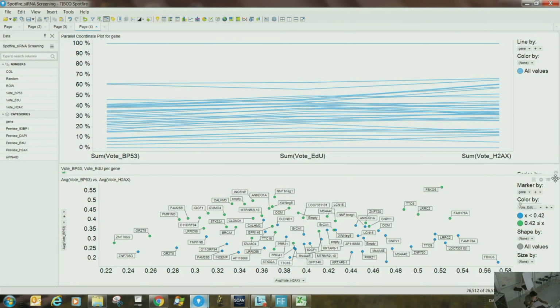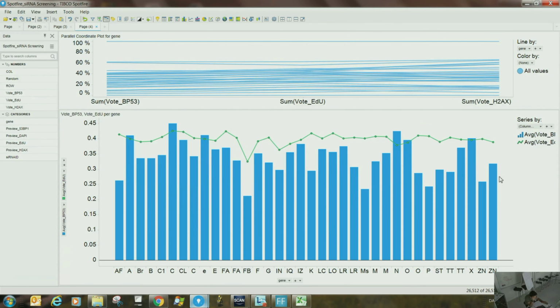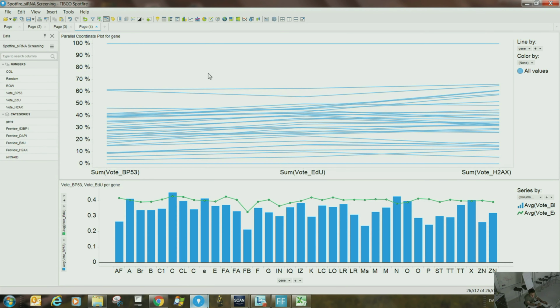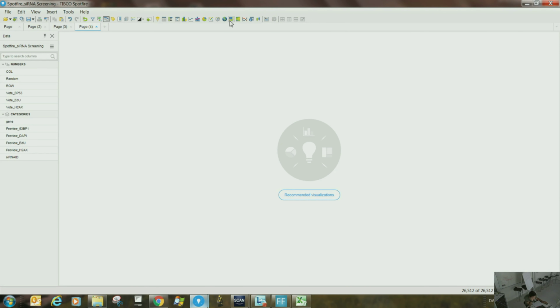Last, very interesting and very useful for you guys, because ultimately we all do the comparison, right? Comparison amongst the different groups. So how do you do this? And maybe before that, I would tell you, I think, a good example for this one. Let's say, because the box plot, that's basically remaining. Oh, by the way, we haven't seen the heat map, right? Or this tree map. Okay, there is a possibility of plotting the tree map also. So let's go to tree map.